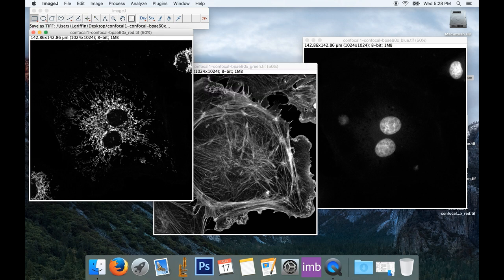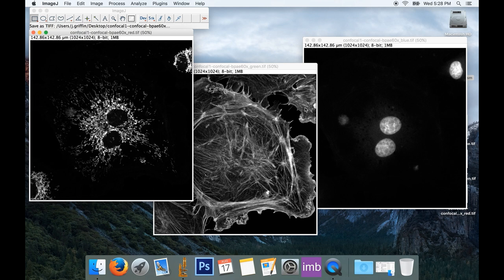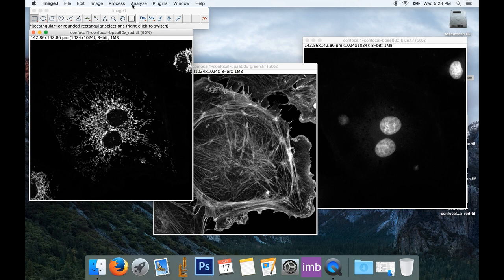So I've got my original saved, so I can turn those into my individual channels in my figure. Now to recombine these into a composite image showing my red channel, my green channel, and my blue channel all in the same image, I'm going to need to go back up to my menu.